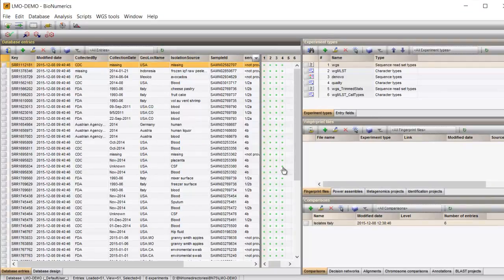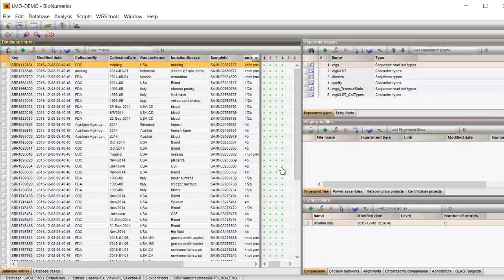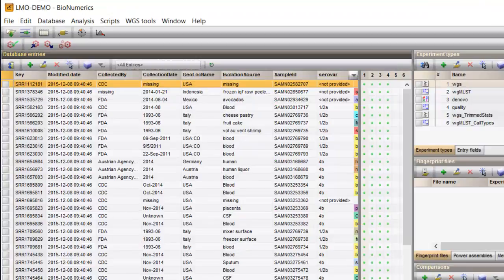Remember, you can always adjust the calculation engine settings from the main window by going to Whole Genome Sequence Tools, Settings.